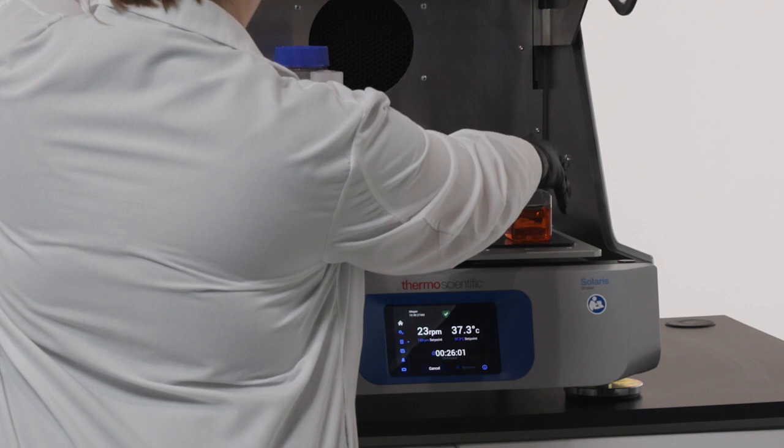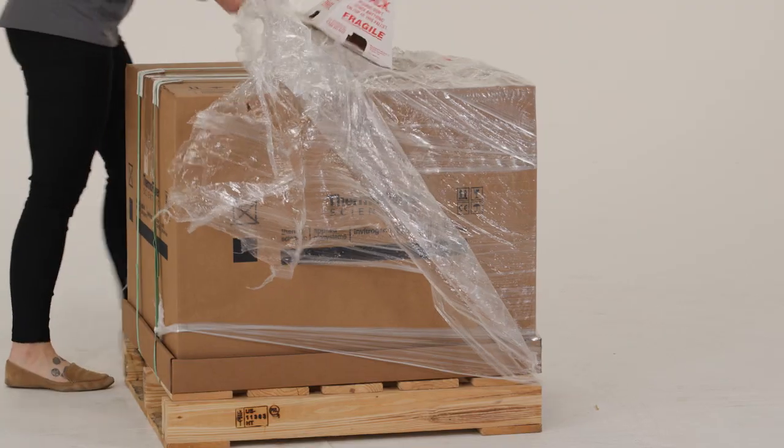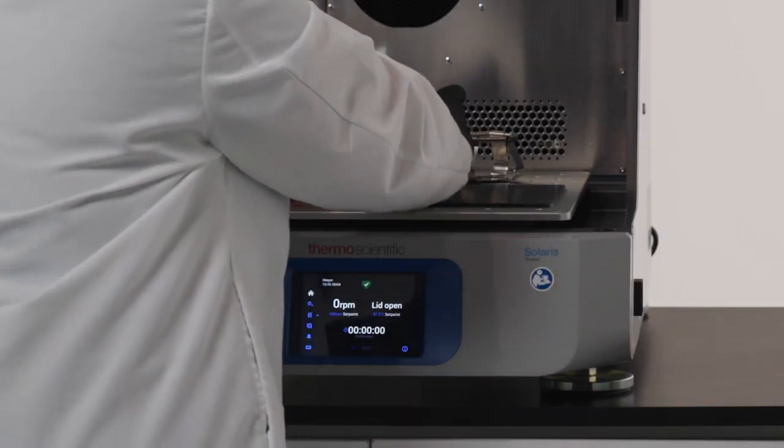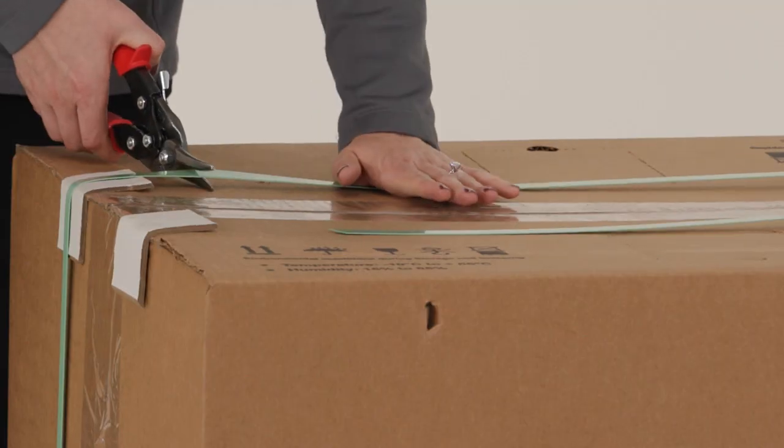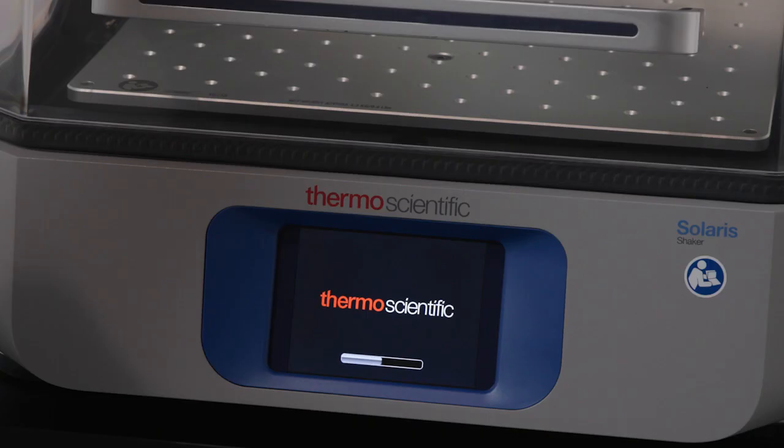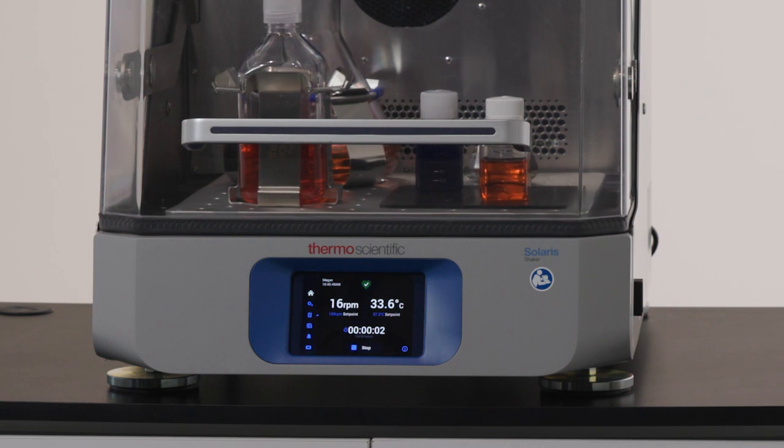In this video, we'll take the Solaris temperature-controlled benchtop shaker from box to bench. We'll review the unboxing and setup process and share some tips to help you get the most out of your new shaker.